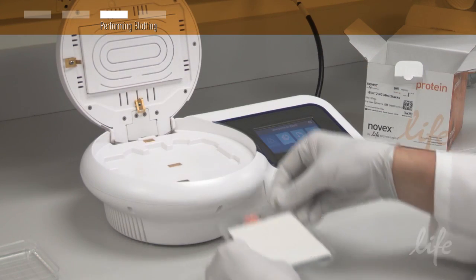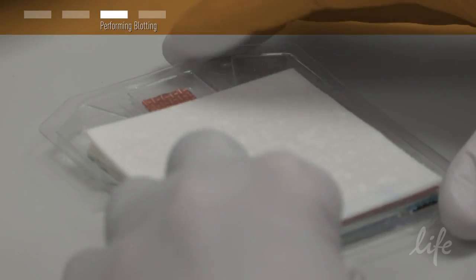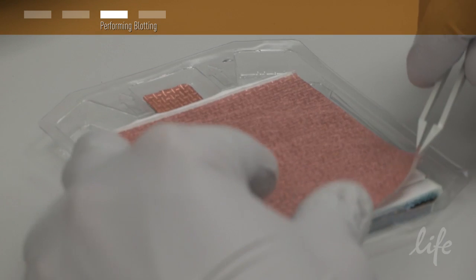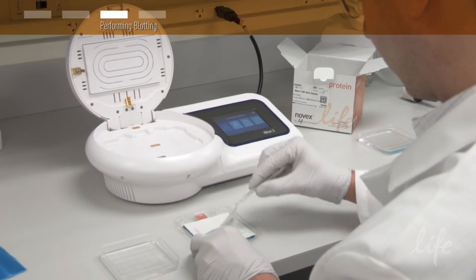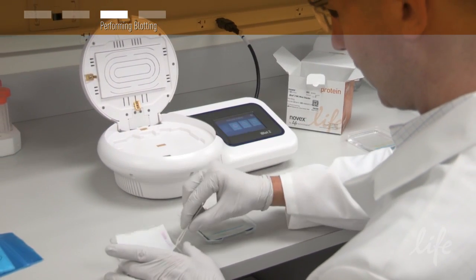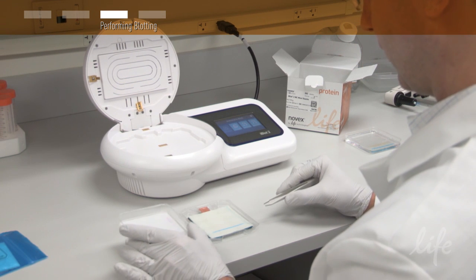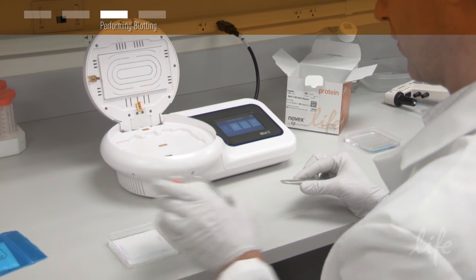To disassemble, open the lid of the device, discard the absorbent pad and top stack and carefully remove and discard the gel and filter paper. Remove the transfer membrane from the stack and either place in water or blocking solution. The bottom stack can be discarded.